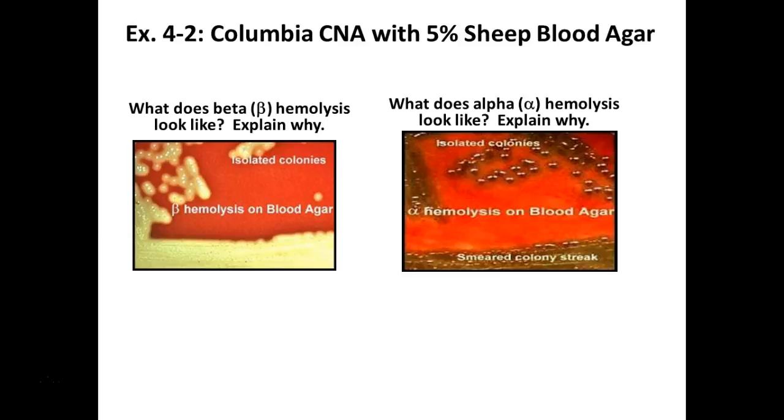Because I did go back over and swab your guys' Bacillus subtilis or cereus. It's actually subtilis we usually have issues with, to make sure that you've got your beta hemolysis that you see here. So you can pass these around and look at them in the light. So who thinks they have beta hemolysis? Right. So what do you think you have? Bacillus cereus or Bacillus subtilis? Cereus, subtilis.